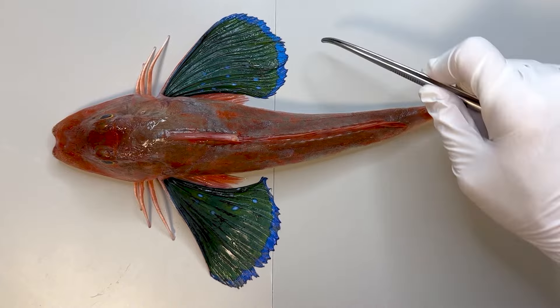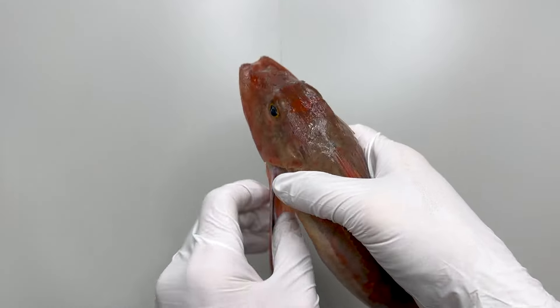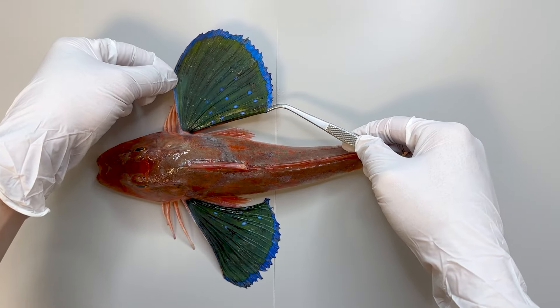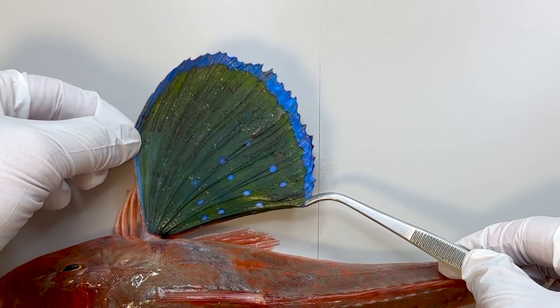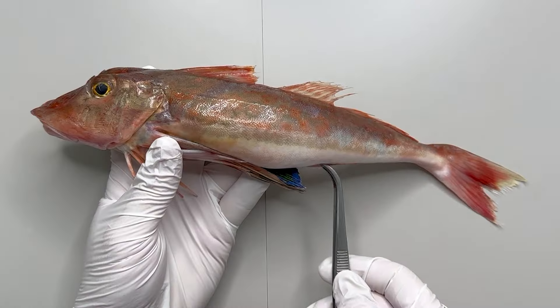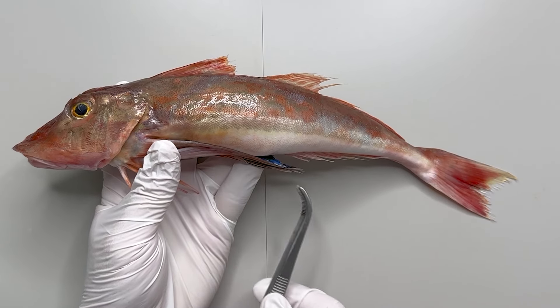Another significant characteristic is their pectoral fin that unfolds like wings. They are not very noticeable when folded, but when spread, they are quite spectacular. This serves to intimidate predators. The dorsal fins, pelvic fins, anal fin, and caudal fins do not significantly differ from those of other fish species.